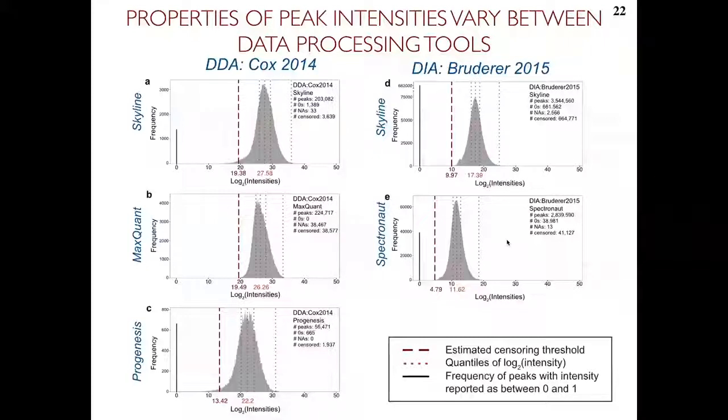And so by working with that, and it really took our group a very long time, and every time there's a new tool, there's new kinds of patterns, right, and new types of decisions. How can we handle all of that? And so the decision that we made fairly early on is to essentially not take the outputs of these tools literally, but try to read between the lines and understand what was the intention of these tools. And again, when peaks are high and well resolved, it's okay. So especially in the low noise level, so what happens then? And essentially what this means is that different tools use different devices to express the fact that the peaks are low or low confidence or hard to quantify, right? And sometimes zeros, sometimes NAs.